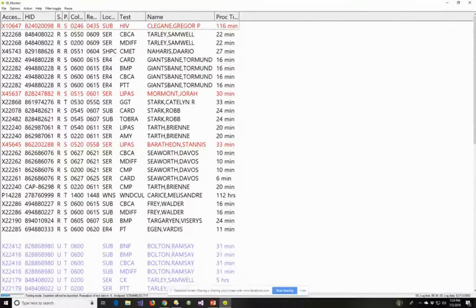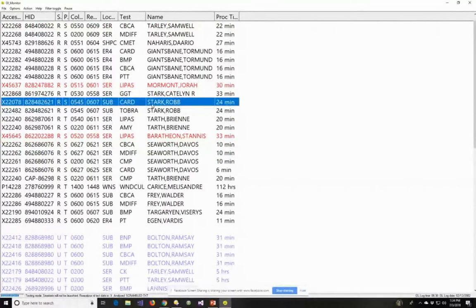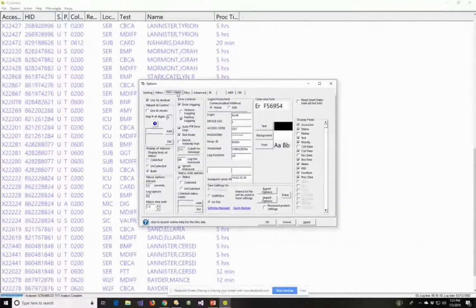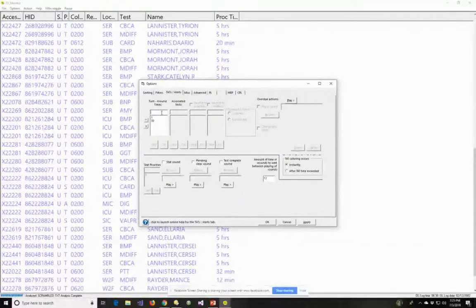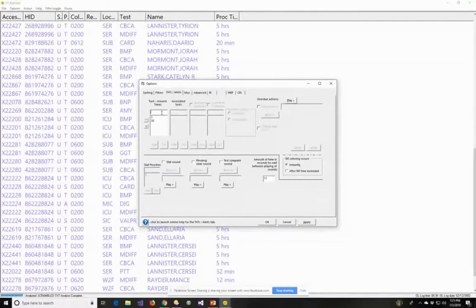These other tests that are stats are only 10 minutes old — they're not red. A cool thing to do is have a scaling system. It's great to let your techs know that a test is overdue at 30 minutes, but if you want to avoid tests ever becoming overdue, if you want to be able to act on it before the situation happens, you should have a warning when they still have time to act. We can have a scale system.